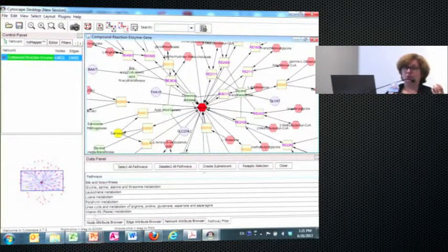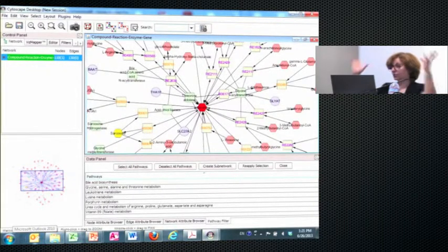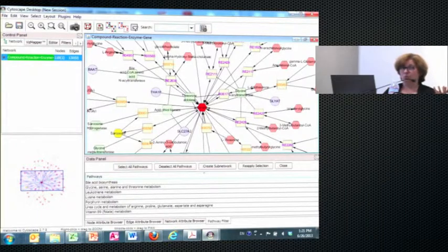When it's one compound, it's really not that important. Where it becomes important is if you input 50 compounds and you get a large network, then you want to see where your seed nodes are, so it's easier to identify them visually. That's what we did.